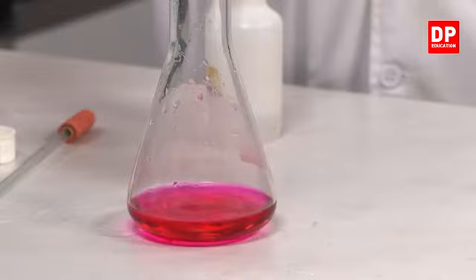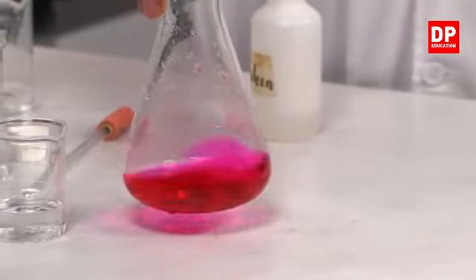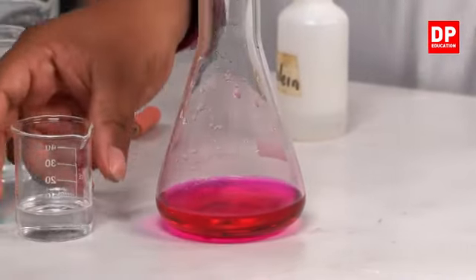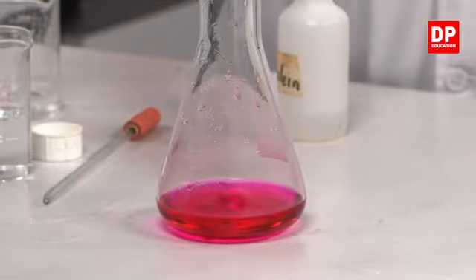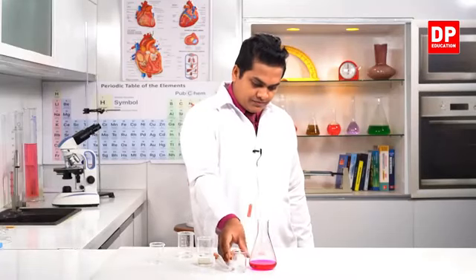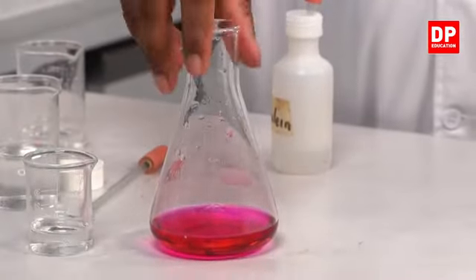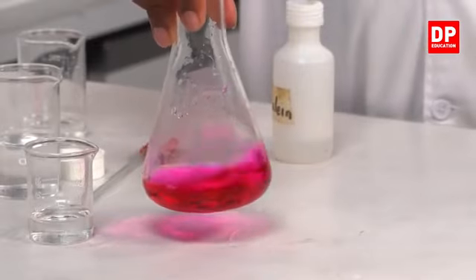Okay. Right. So we'll mix it. Let's add once again another 2 or 3 drops. Right, you can see the color is getting changed somewhat.